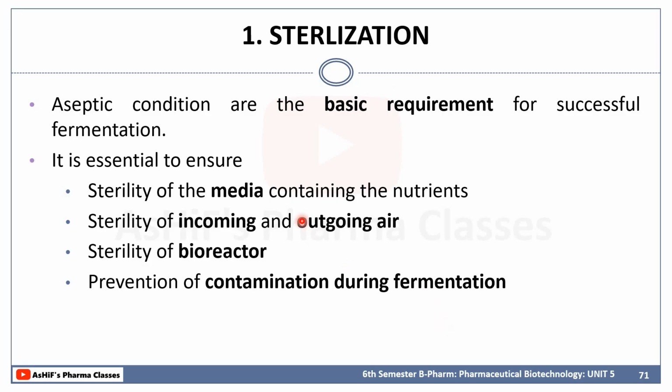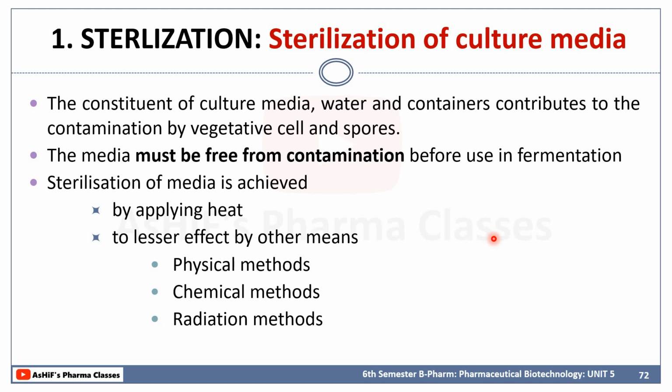So it has to be performed in aseptic condition. This is the basic requirement for a successful fermentation. And usually sterilization is very essential to ensure the sterility of the culture media, ensure the sterility of incoming and outgoing air, ensure the sterility of bioreactor, and also for the prevention of contamination during the fermentation process.